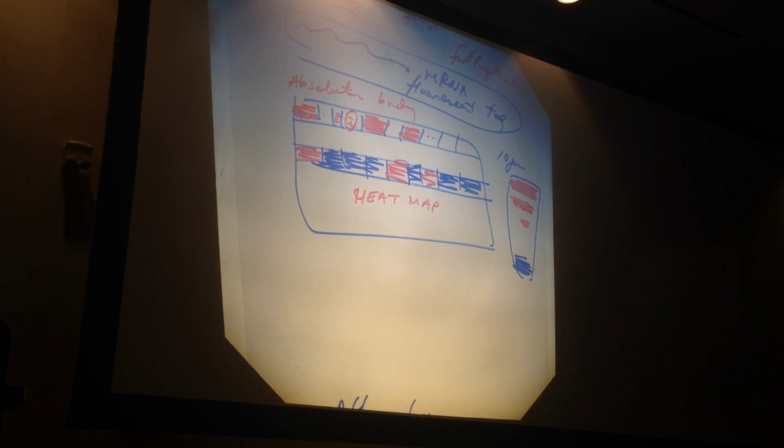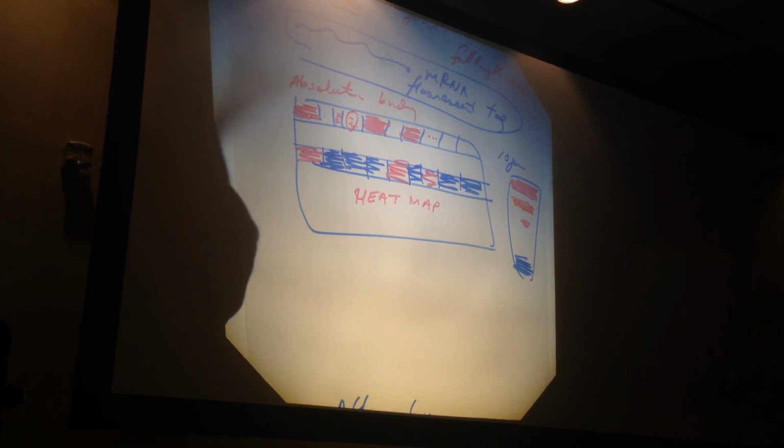Yep. So the ultimate goal of both these techniques is to measure RNA expression, right? Right. But what would the advantage be for using this as opposed to qPCR, where you're basically doing the same thing? Is that just more time intensive or something? qPCR is just for one gene at a time. This you screen thousands of genes at a time.